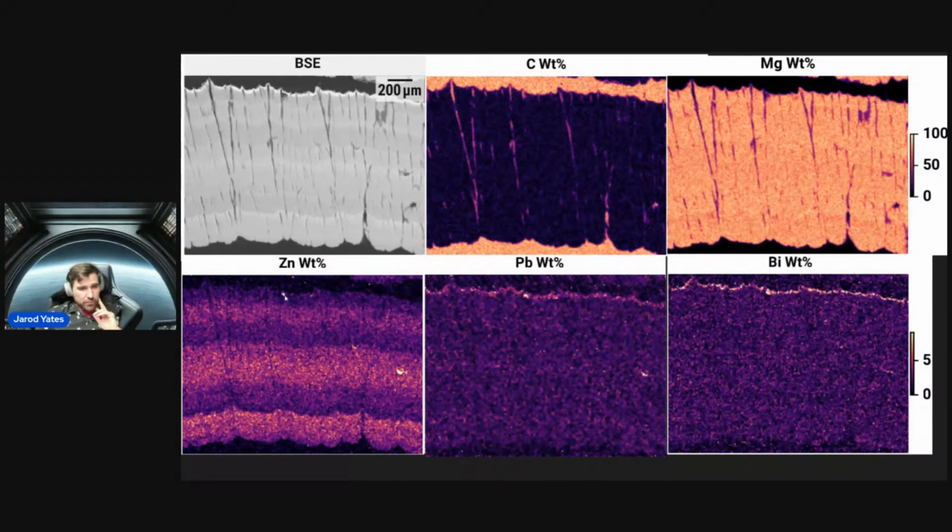Also important is this bright spot that you see for the zinc and for the lead. Those are the zinc-lined lead microspheres that have ruptured, which is why you're seeing it show up so brightly in those areas. Over here, they claimed in the AARO report that these vertical lines might have been some carbon-based binding agent.